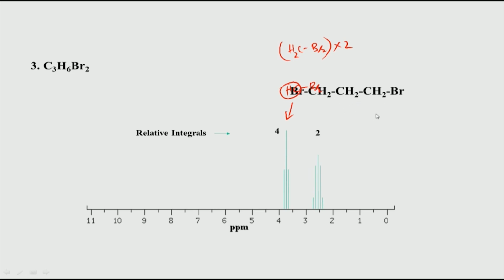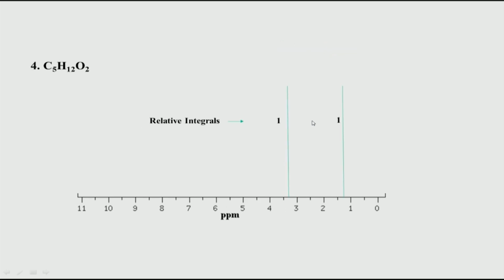So, therefore, both of these will show a triplet, because each of them is coupled to these 2 hydrogens. So, there is a triplet, and that is what you see here, you get a triplet from the edges. So, we can see this is how we can interpret the presence of the coupling based on the coupling and the integration. So, we will look at the next example, which is here.